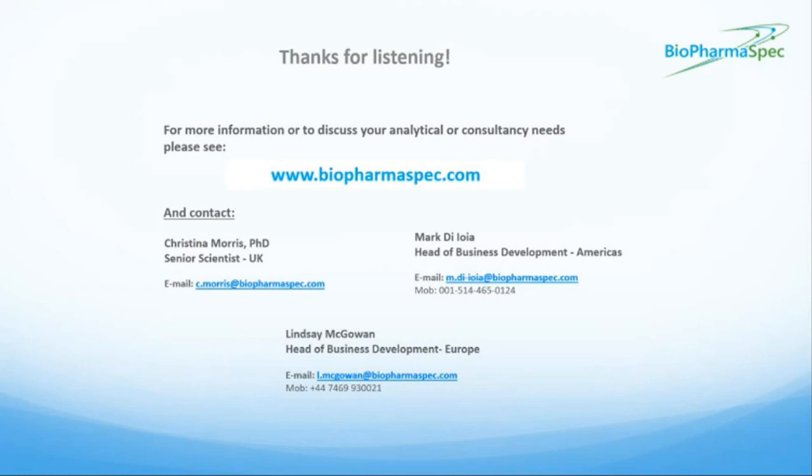Next question. Are you running DDA runs prior to SWATH to generate a spectral library to match to? Yes. So we're running the IDA because we're using a SCIEX system, and that's to generate the targeted MS-MS data where we have a known precursor ion that gives us the MS-MS fragmentation spectra. And then we will use that to build the library. It gives us some more confident hits, as I've described, and we'll run the SWATH data and then match that to the library that we've made from the IDA. Yes. All right, thank you.